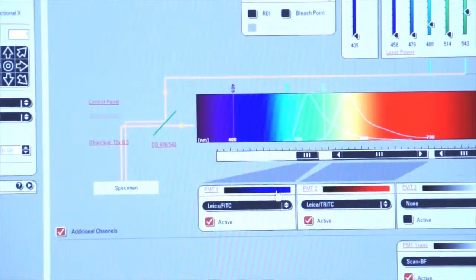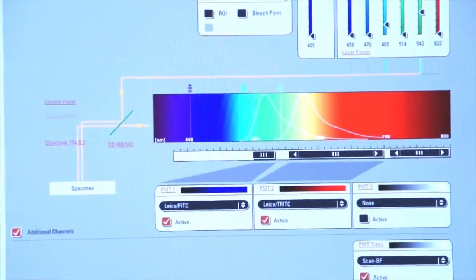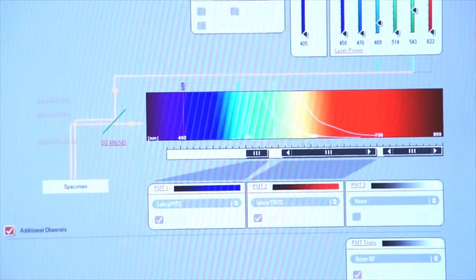And now as you can see, the color here has changed. And so my output for this screen, if I click on live, will be blue. Now you can see that it's a blue image.